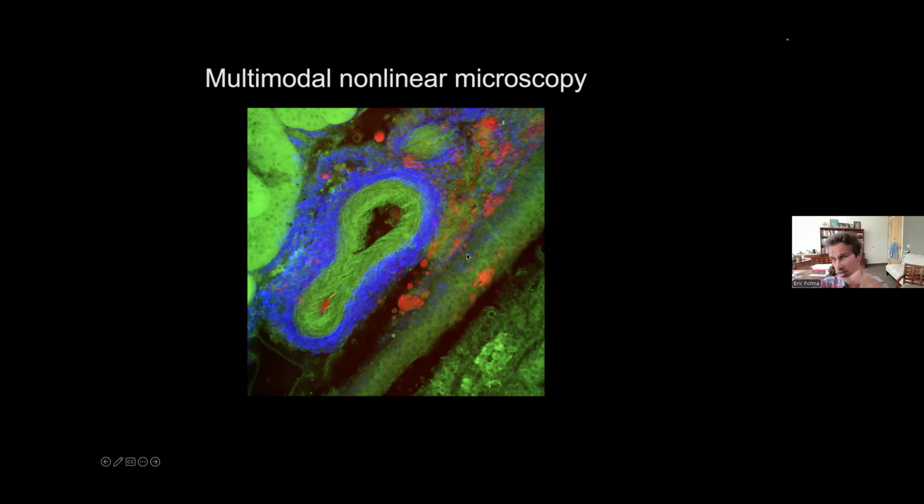Together, they give this beautiful image. It's all label-free, but it's molecularly specific. And that's very relevant in many of these studies where we'd like to pinpoint what it is that we're looking at. Can I get extra contrast based on these structures? This is the kind of contrast that makes such analyses possible.